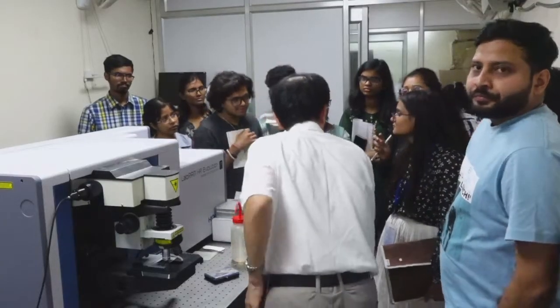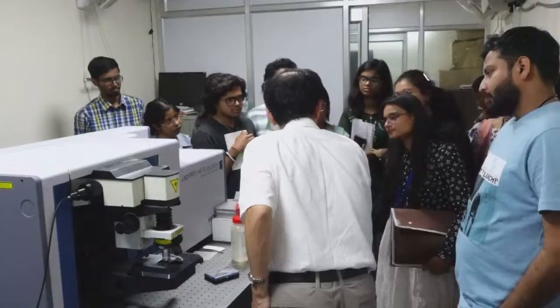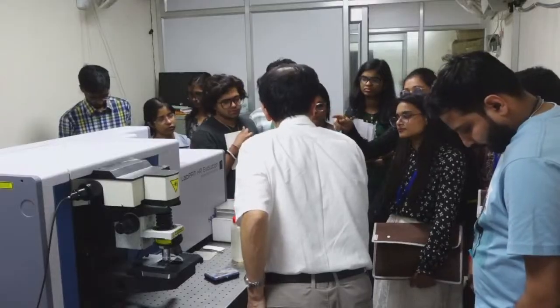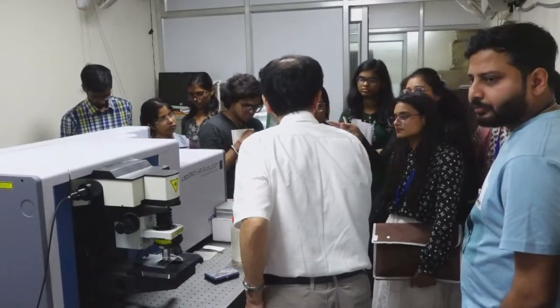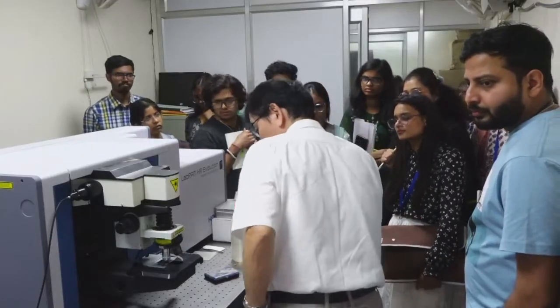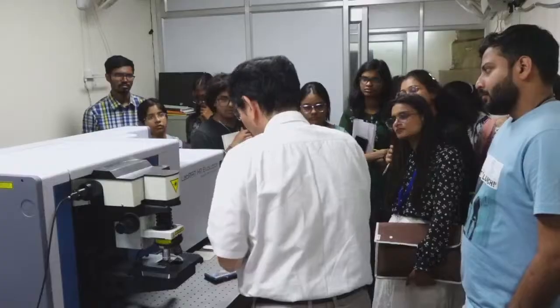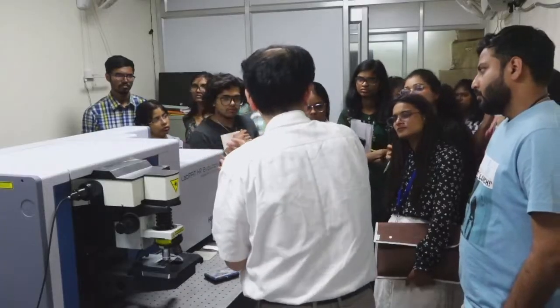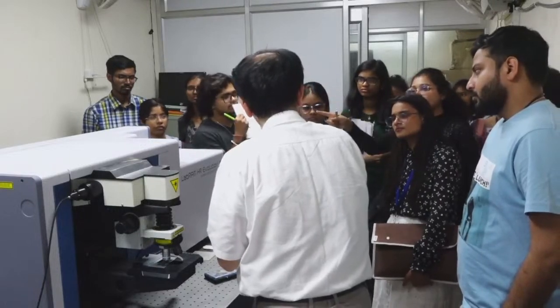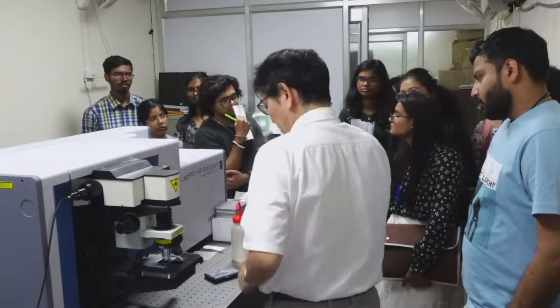But why is there a need of signal collection? Because we want all the scattered light to go through this pathway, to the dichroic mirror. Then eventually it will separate the Raman and the remaining light. Why is there a need of signal collection at this point? I mean, you want to deliver all the signal into the detector. Yeah, because the mirror will work there, no? It will separate the desired light. It will go to the detector.